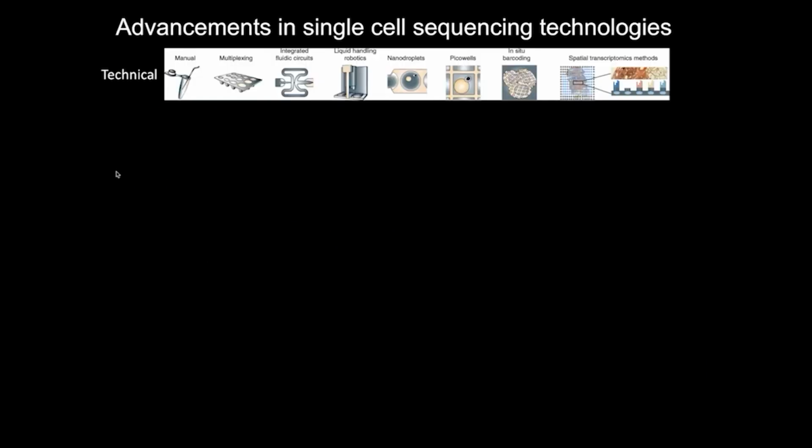Now, my lab utilizes a lot of single-cell sequencing technologies in order to study cell types and cell fates. To give a little bit of background, in the early days it was manually picking a single cell to sequence. Over the last 20 years, the technology has advanced incredibly such that you can now sequence millions of cells at the same time. You can do spatial transcriptomics where you put slices on grids and can identify gene expression within small regions.